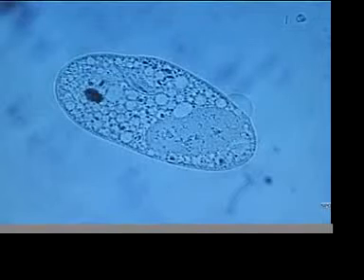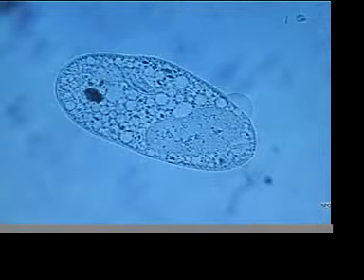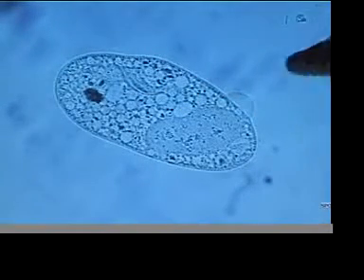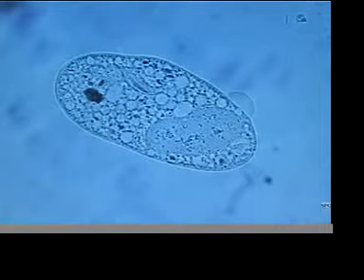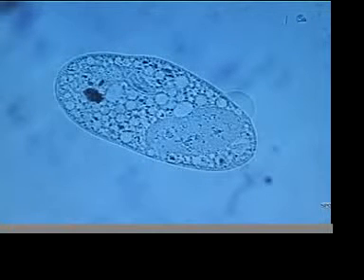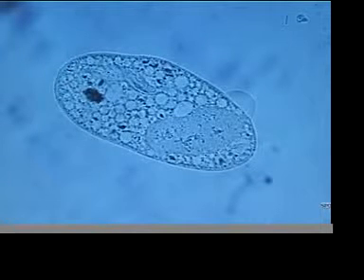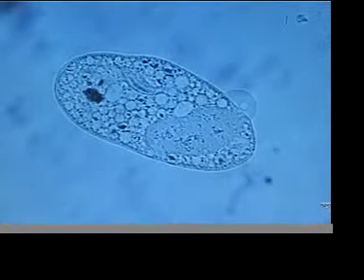Here we see a paramecium, very much deformed, still alive. You can see the cilia beating here, but there's a blister, and of course it's not swimming at all. I'm looking at this through the DIC filter. Hopefully you can see that.